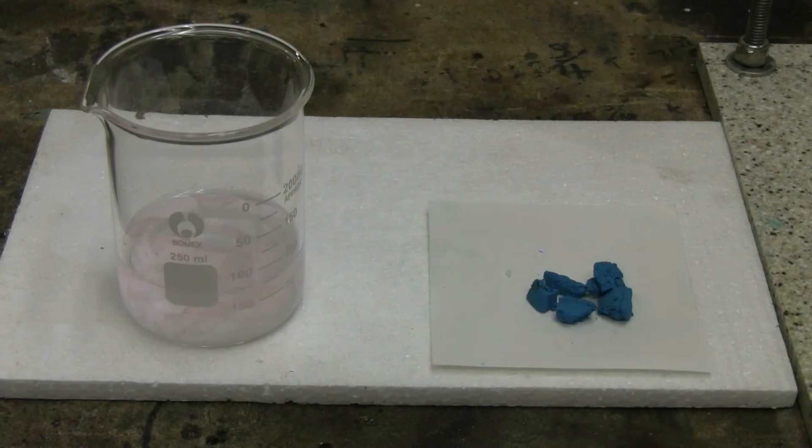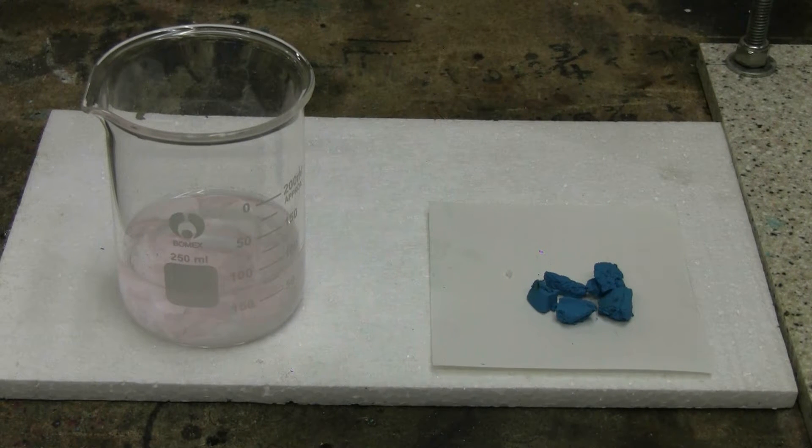This video is about making yet another compound of copper, copper aspirinate. In the 250 milliliter beaker on the left, I have 9 grams of acetylsalicylic acid, ASA, in 75 milliliters of water.